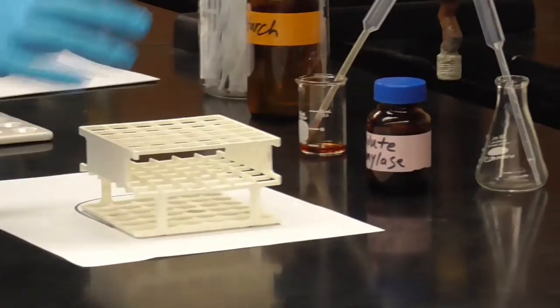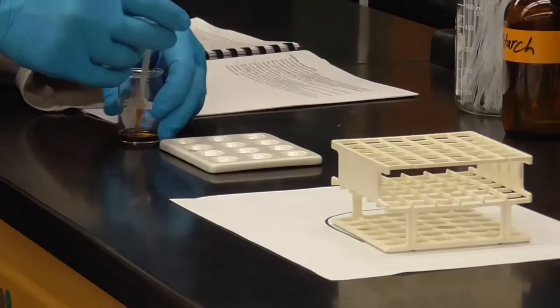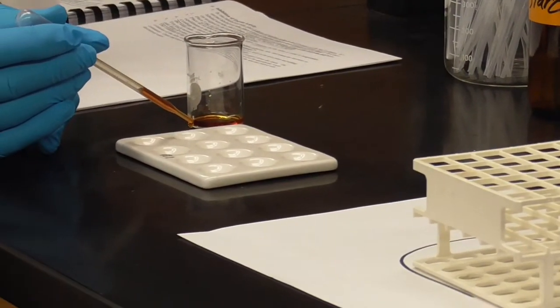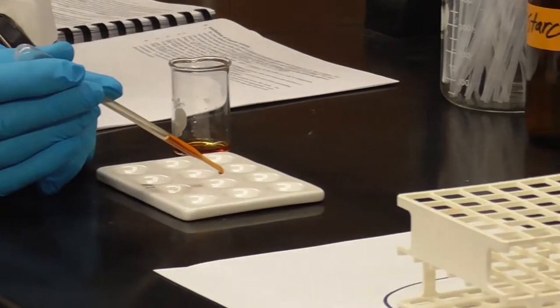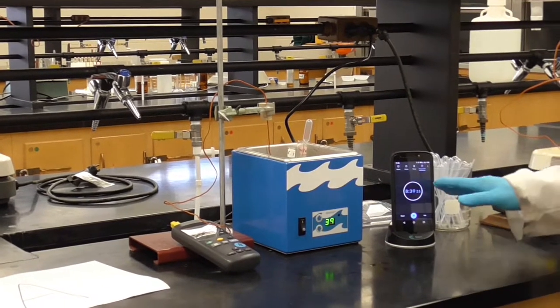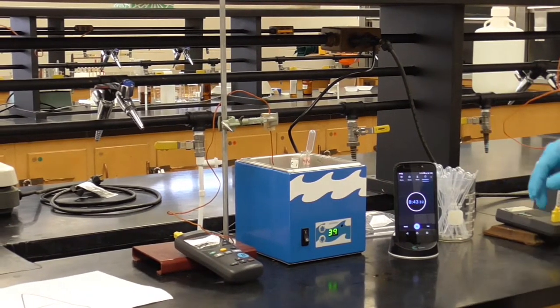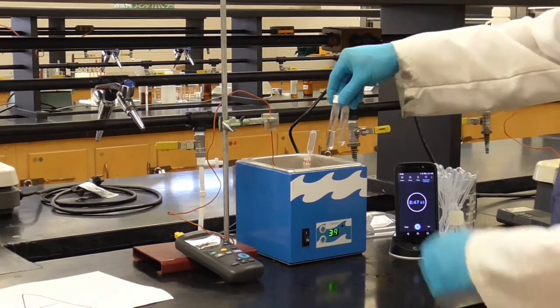Let's go ahead and add our drop of iodine indicator. And we don't need the whole plate this time. We're just going to do 3 of them. So 1 drop, 2 drops, and 3 drops. Okay, they've been sitting in their water baths for at least 8.5 minutes here, plus that initial time, so that's 10 minutes. So what we're going to do is combine them together.